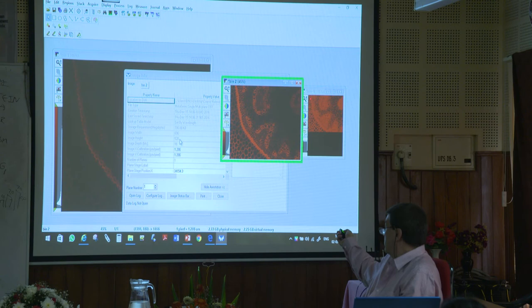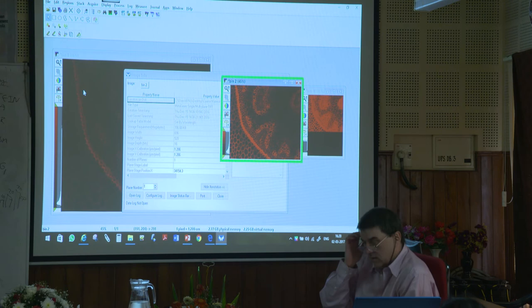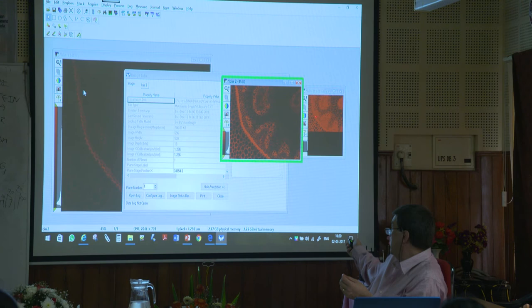Look at these gray values here. It's probably just about saturated. It is. Whereas here it's a little bit saturated, not quite. And then here it's darker, okay? The reason you do binning, you save computer space, and then you can go faster too. If you want to take more frames a second, it makes sense because here you only have so many pixels.